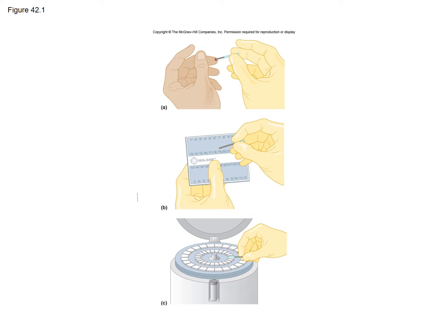So when you put the sample of the blood inside this machine, it starts to rotate at maybe a few hundred per minute to separate the blood components. Blood components are going to have the blood plasma and the blood cells. So if this is a tube, for example, and you put the blood sample inside the centrifuge machine, it will rotate very fast.